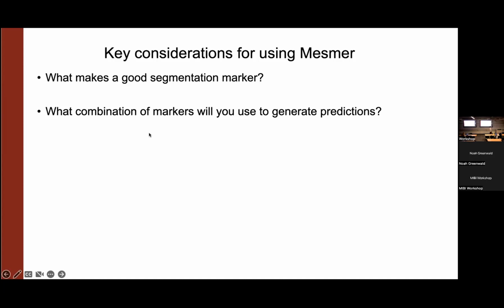And so adding a histone mark to your membrane channel, or DAPI, is going to dramatically decrease the performance of the algorithm, because now instead of seeing a nice, clean, crisp honeycomb-like staining pattern, it's just going to be a blob everywhere. It's going to be like, well, I don't know what to do with that. So it's not the case that more is always better. You want to strike that balance between including as many markers as necessary without doing any more.